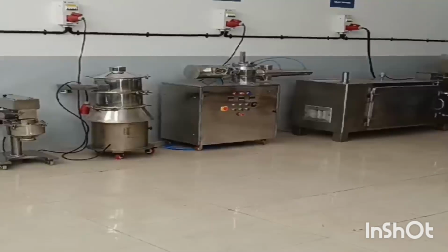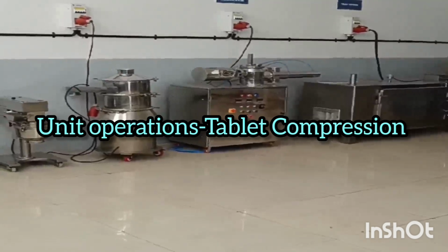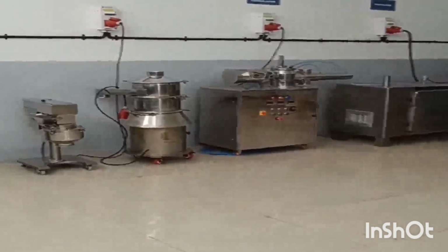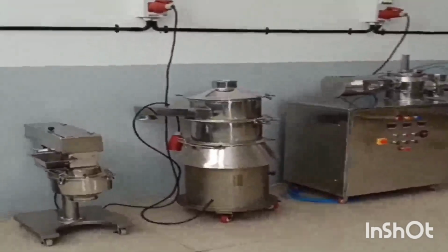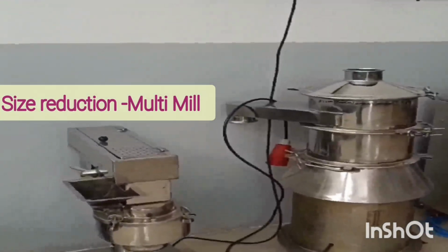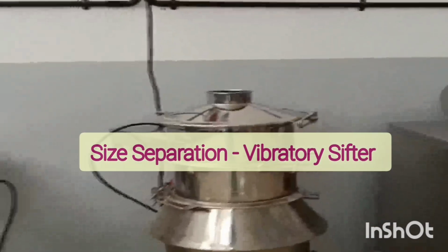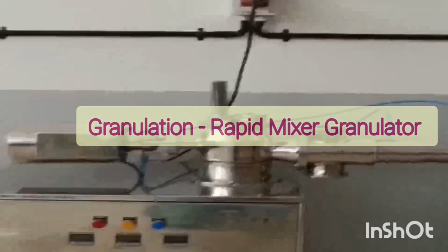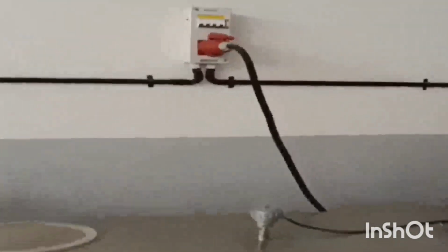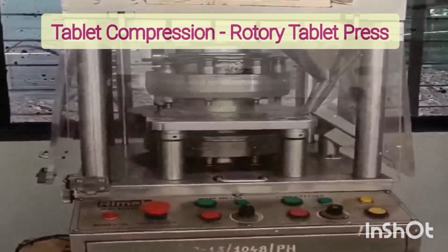In this video, we have demonstrated the various steps involved in formulating a solid dosage form like a tablet. The various steps involved in formulation of tablet include size reduction by using multi-mill, size separation by using vibratory sifter, granulation by using rapid mixer granulator, tray dryer for drying of the granules, and finally formulation of tablet by using tablet punching machine.